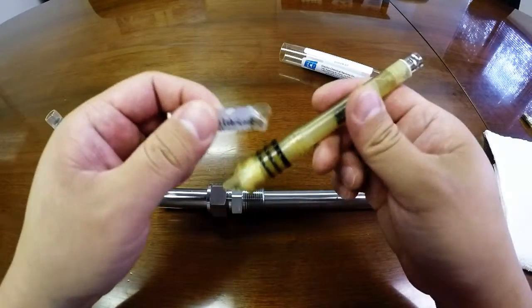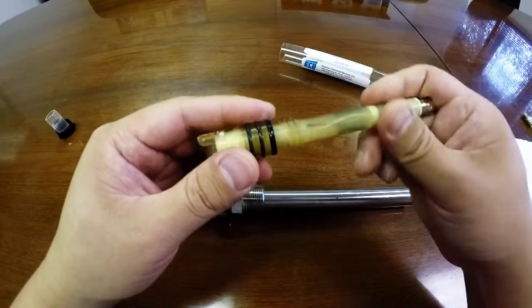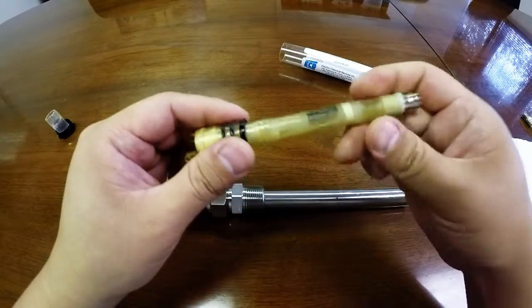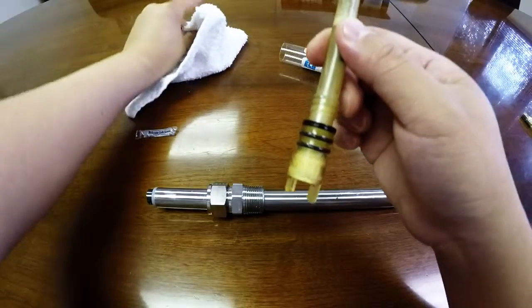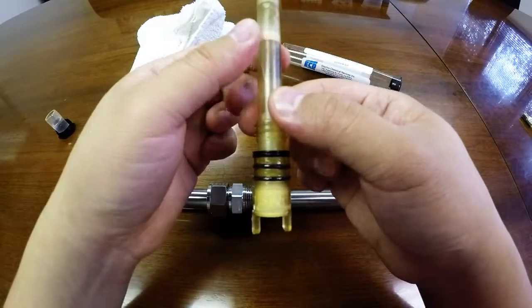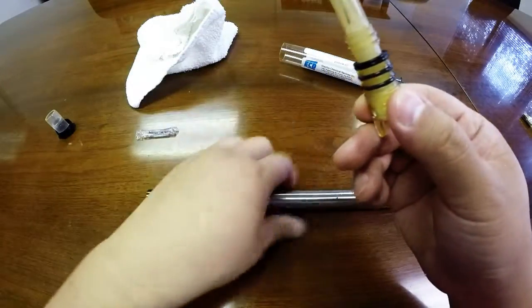Place lubrication on the O-rings. This is to prevent dryness and cracking, and also to make a perfect seal with the S80 body.